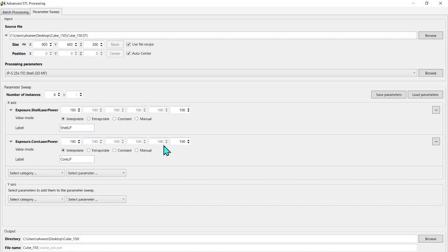And this is useful if we want to expose, because we already know the conditions for our structure, so we just need to do one array. Remember that you cannot do an array with the other option if your structure is bigger than a single block printing. And this is the way you will do the array in this case.